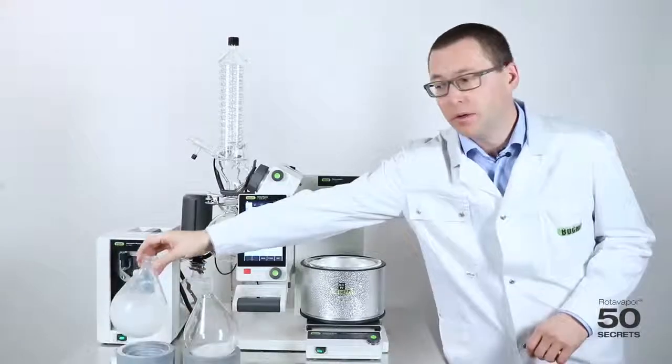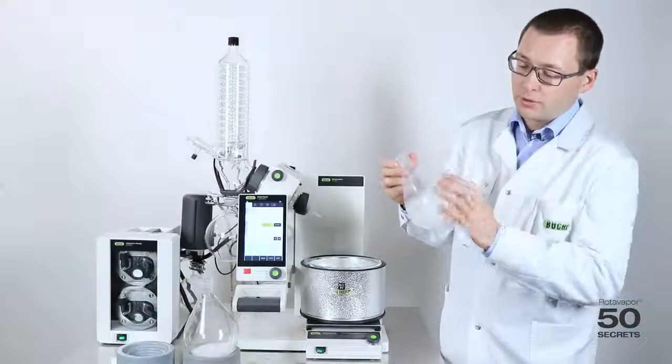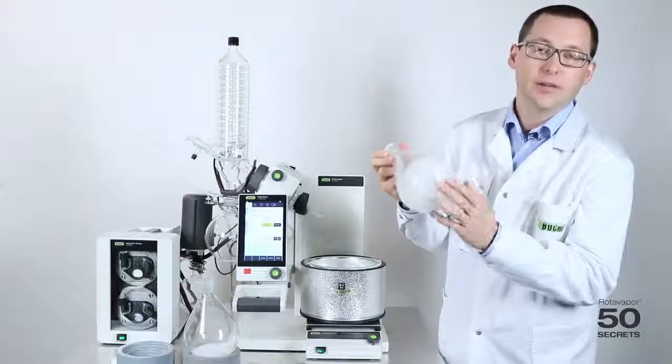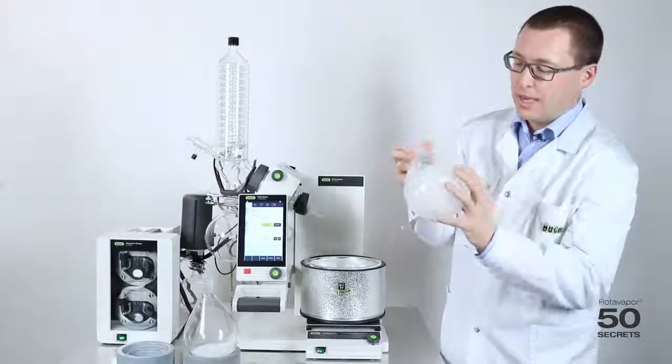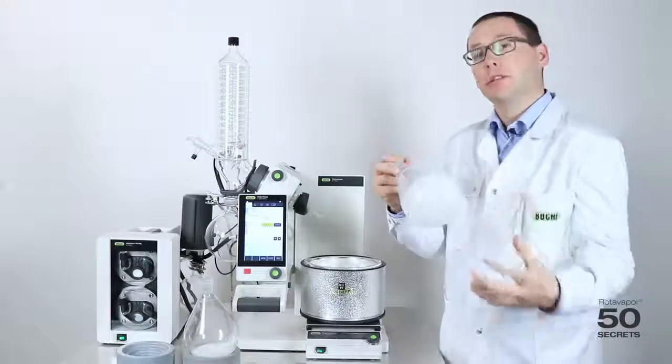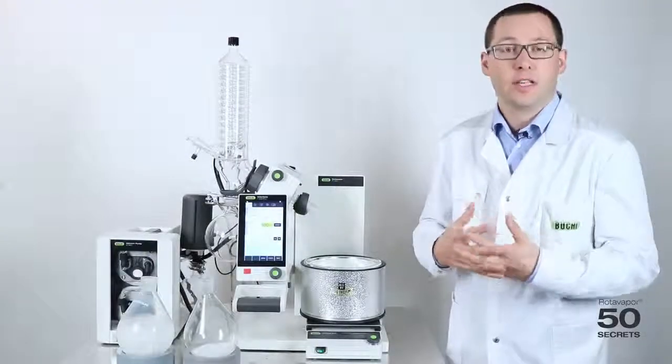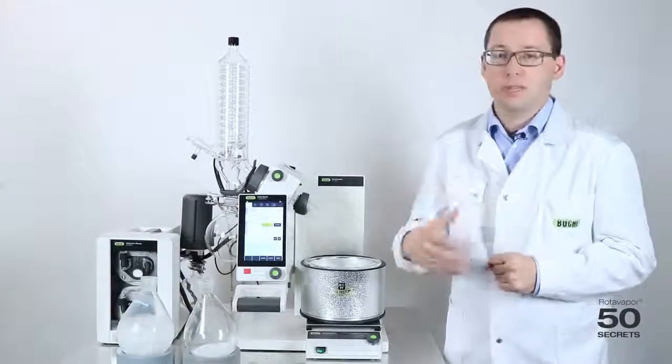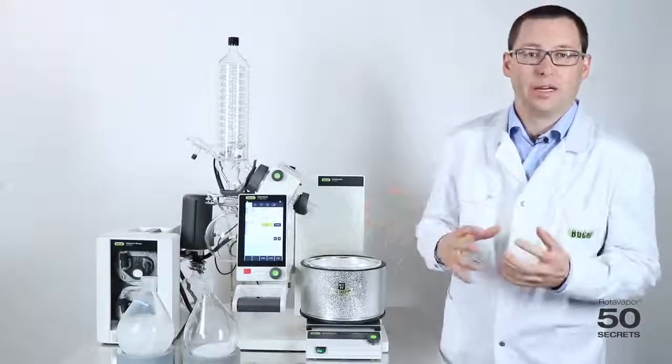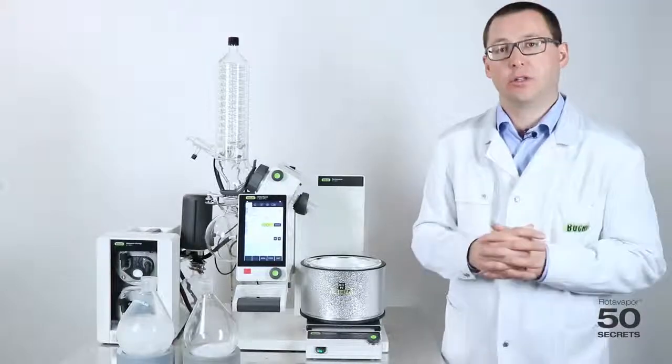The second would be using a rotavapor. By using the rotavapor, you get a very nicely evenly distributed area of frozen sample, which means in the later freeze drying process, you are faster. The advantage of the standard process is that you can process multiple samples at a time, which means you have much faster sample preparation time.